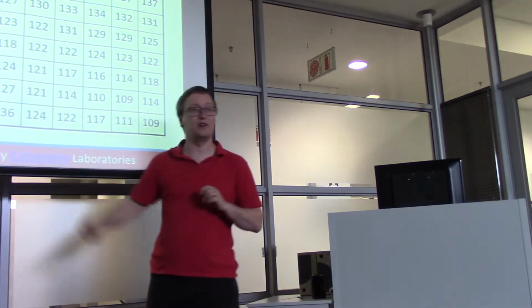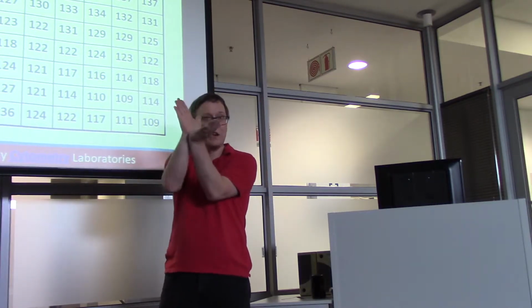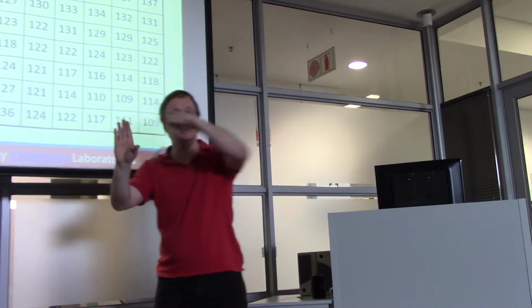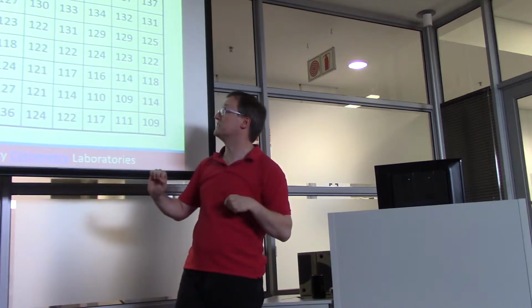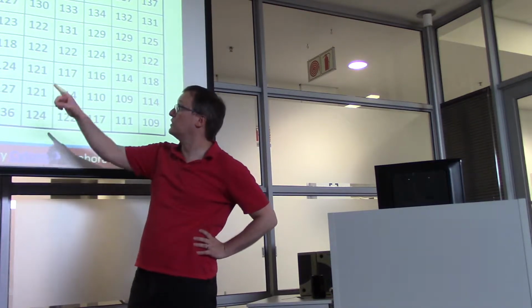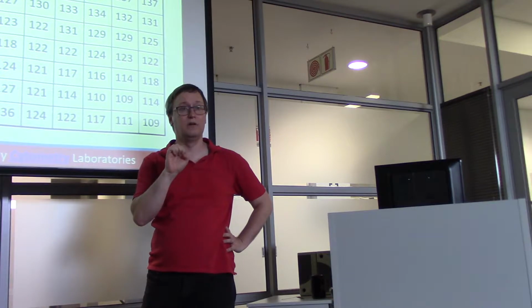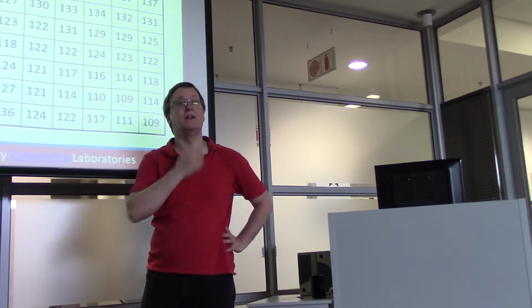So the Gaussian kernel filter is going to grab information from a grid of 3x3 pixels in the original image and use them in a Gaussian kind of way to combine information across those 9 points. So in this case, you can see the weights that are being placed on each of those 9 points. Which of the 9 points gets the strongest weight in the output? 4. And that one is located where? Center. In the center.